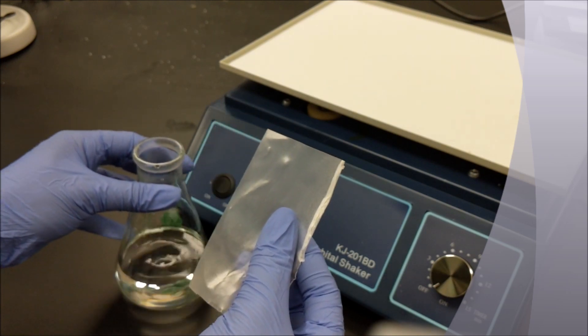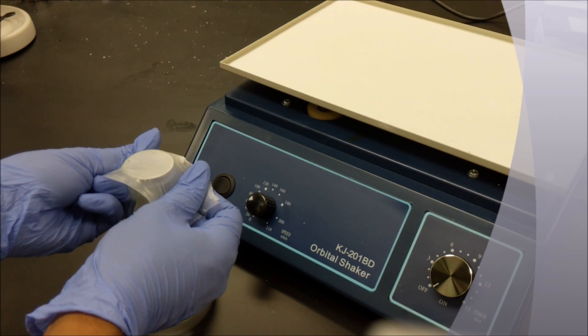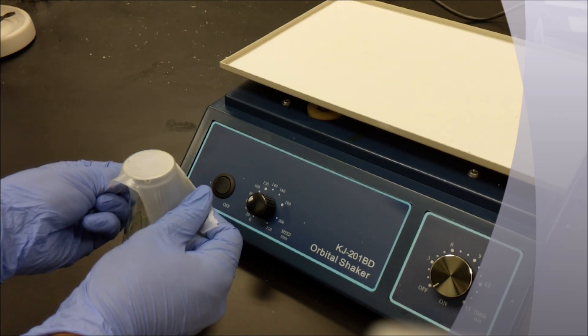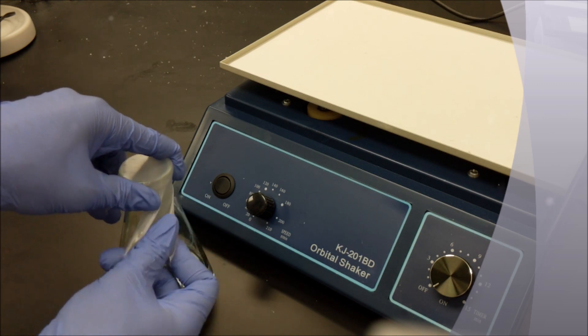Parafilm is very stretchy, and so you'll cover the top of the flask and pull down very slowly to ensure you do not rip the parafilm during the transfer process.